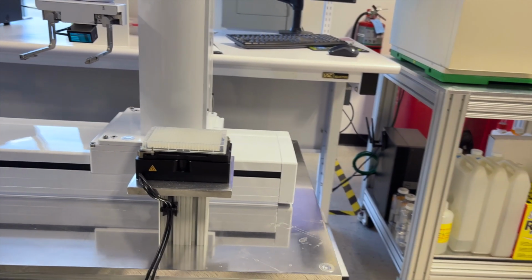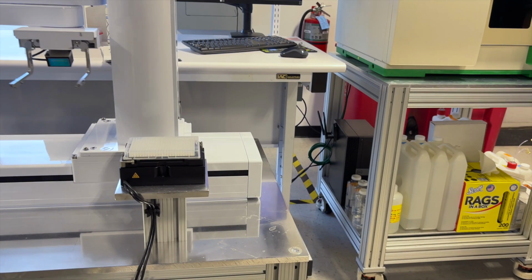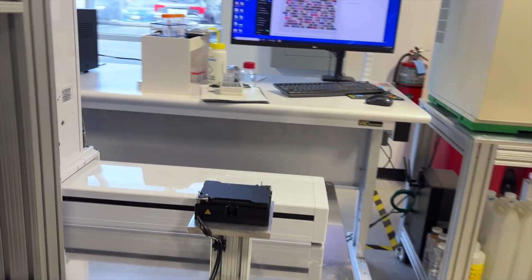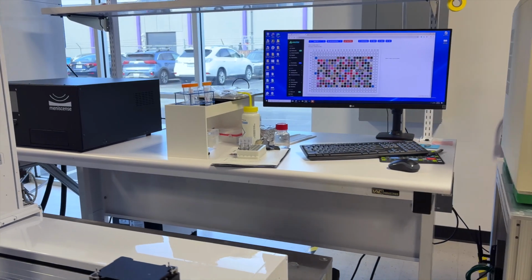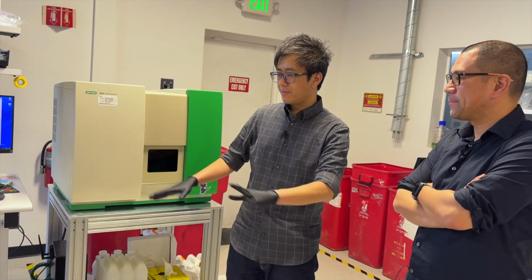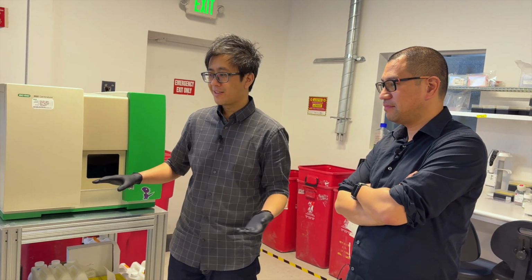How sensitive is this process to moving, for example, a table by an inch? An inch would be pretty catastrophic. Yeah. I'll usually say 1 millimeter is where you start running into problems. Wow. That said, you can design your automated systems such that they're pretty robust to changes like this.